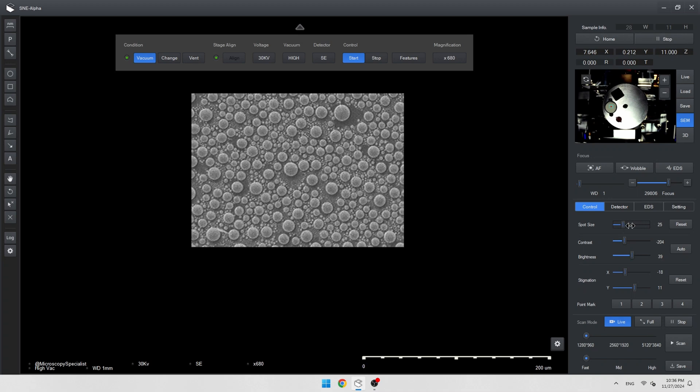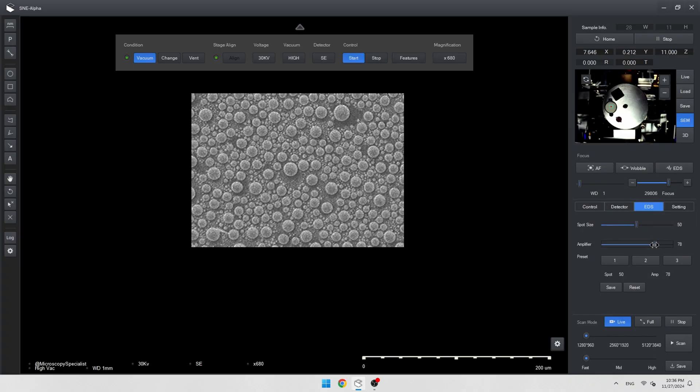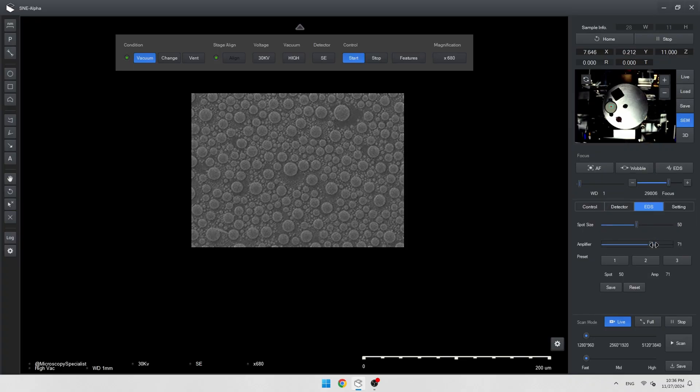So if I want to increase the spot size, I should shift this slider left. Signal will be higher and image will be brighter. We also should check the gain of the detector and secondary electron collect settings. For this microscope gain about 70 is the best choice.